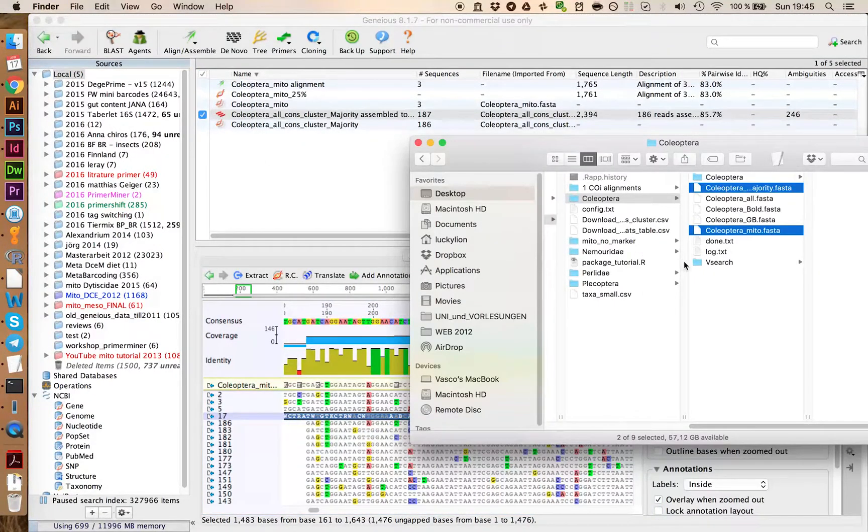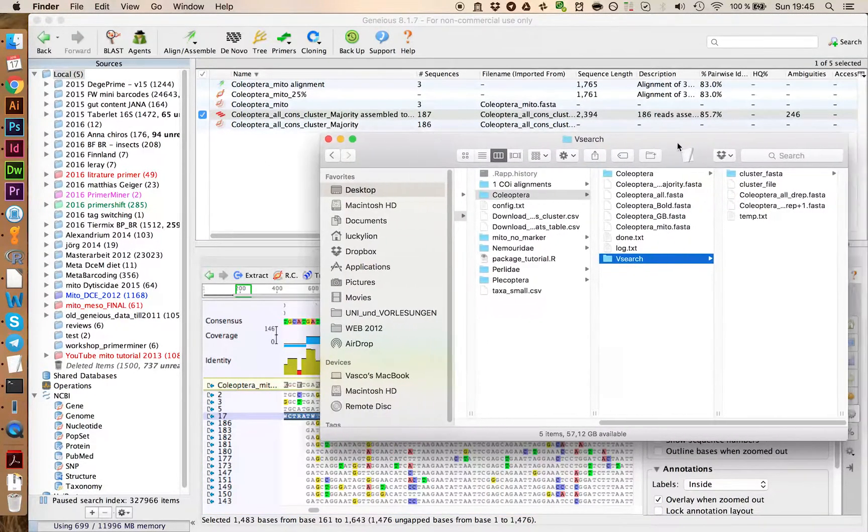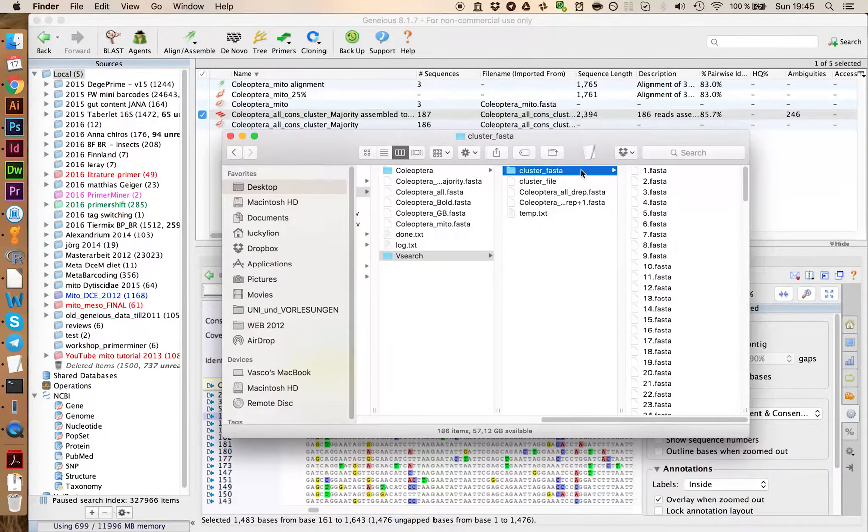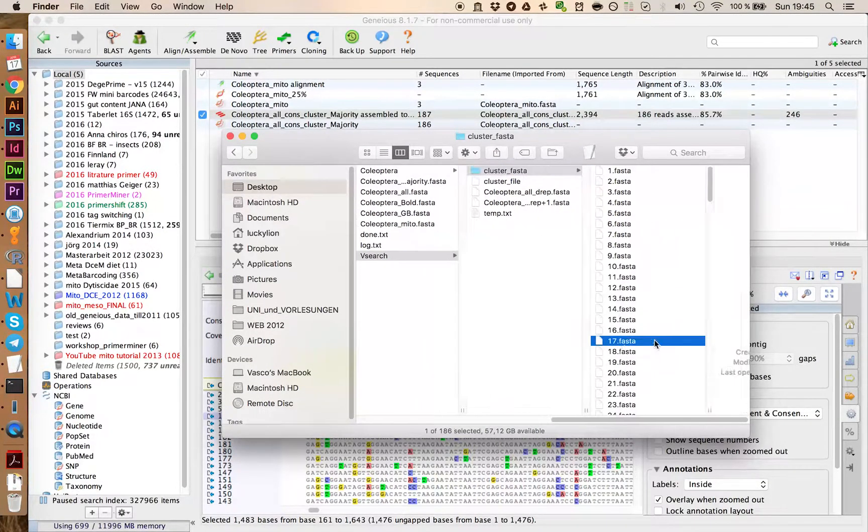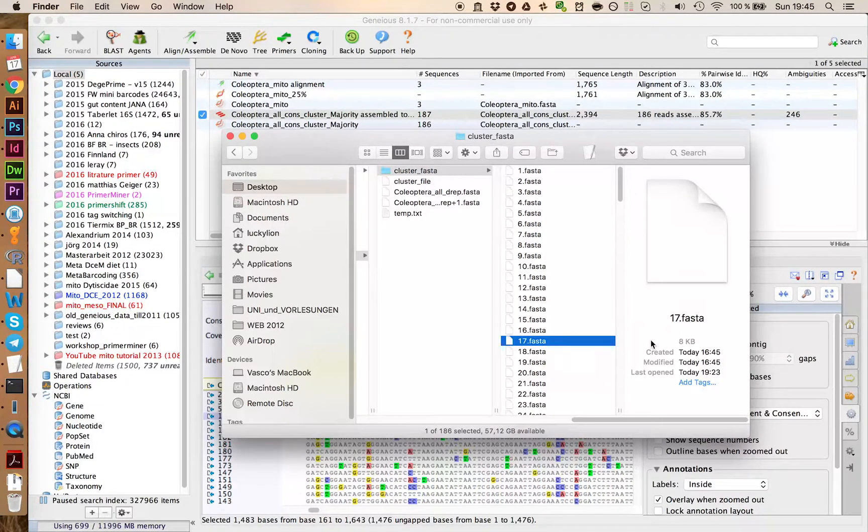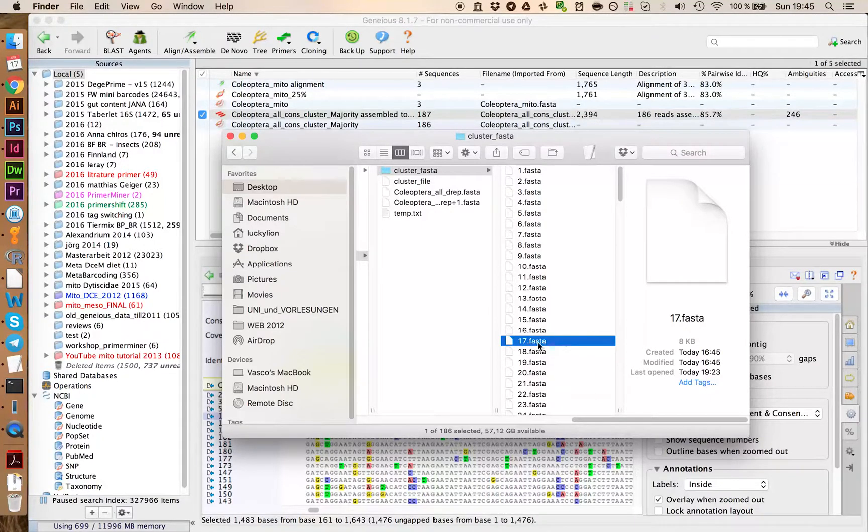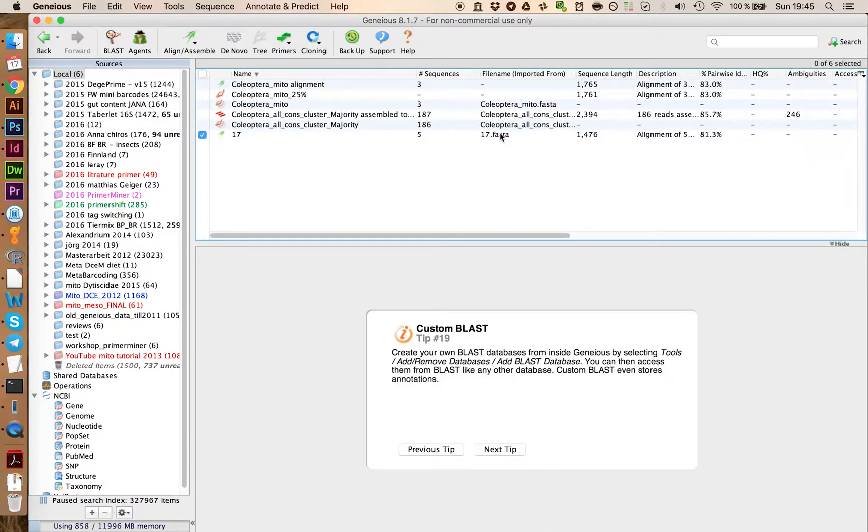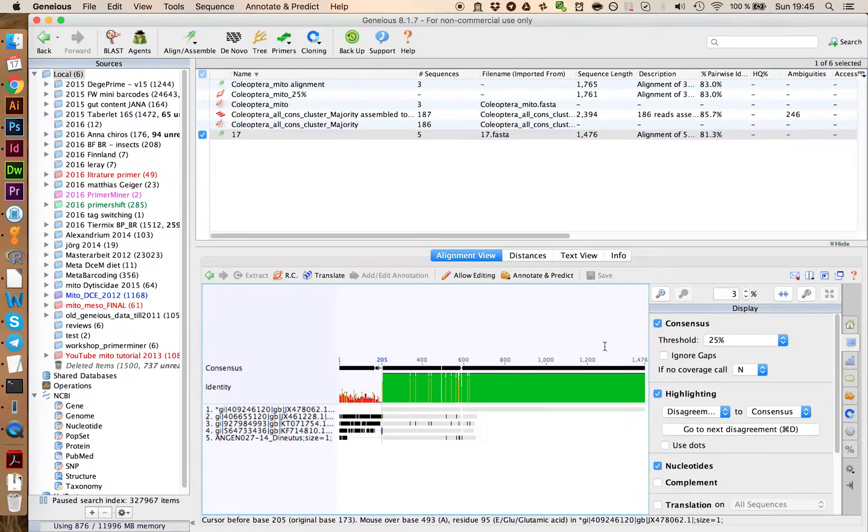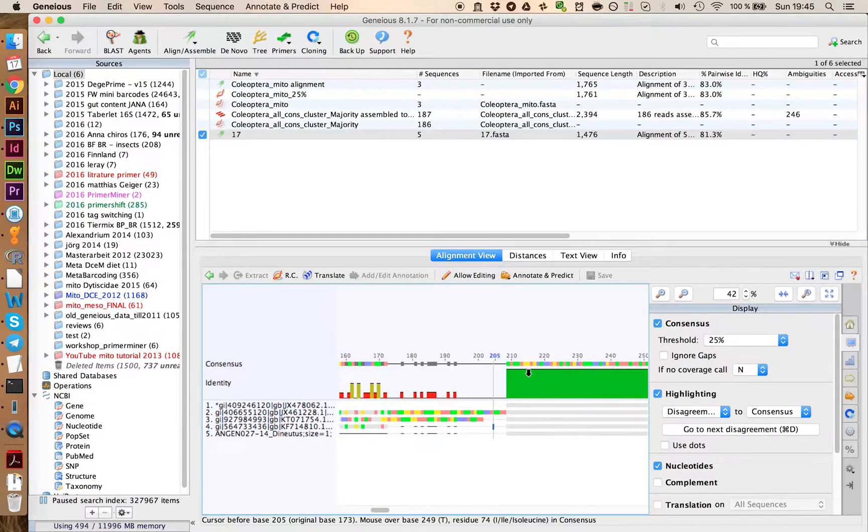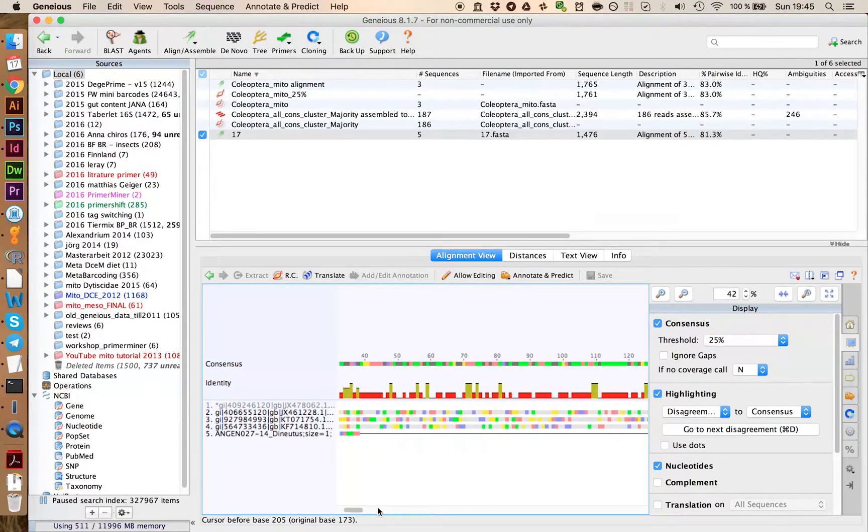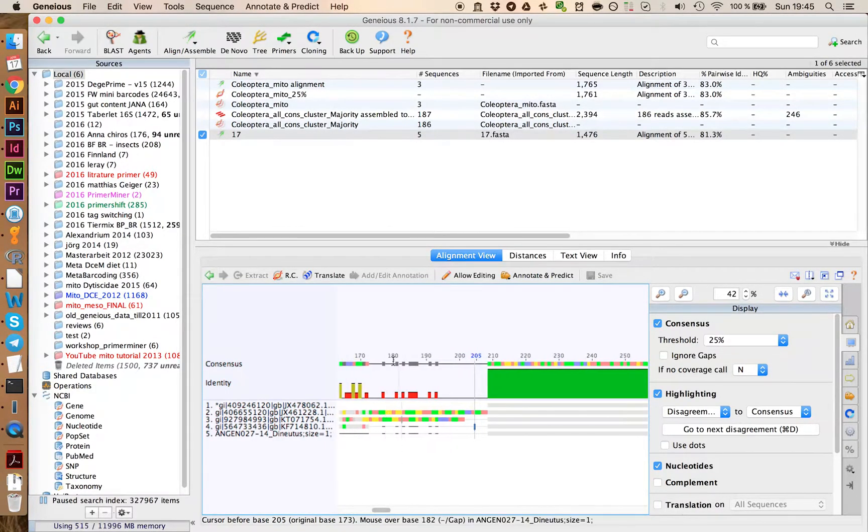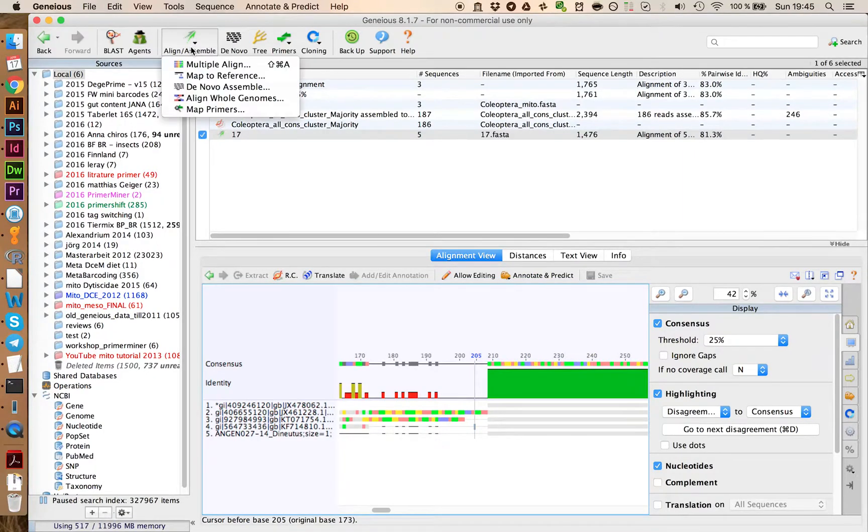So if we go on Vsearch, you find here the ClusterFasta folder, and then here we have the alignment of each OTU which Vsearch generated. So we can import this into Geneious. And if we take a look at this, you see that Vsearch did do some errors by aligning these sequences here. So what we can do is, we can try and see if we can fix this problem.